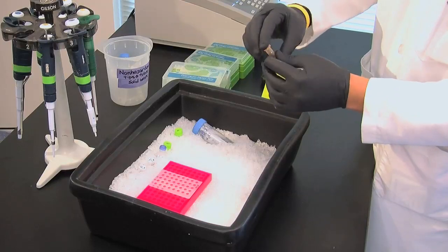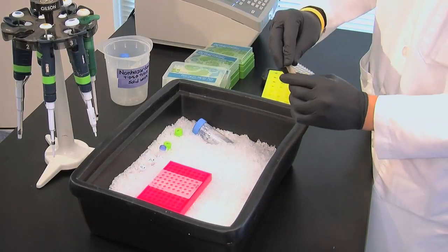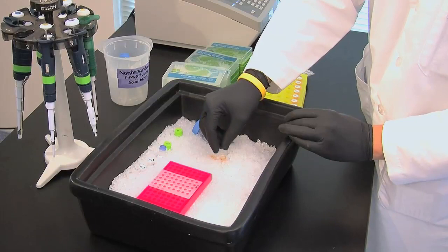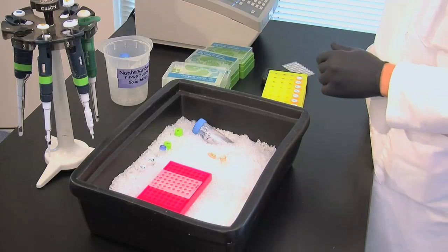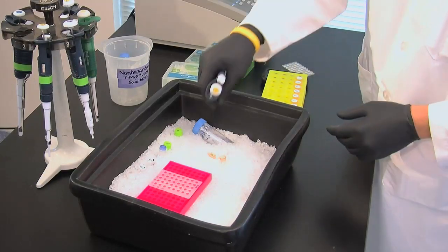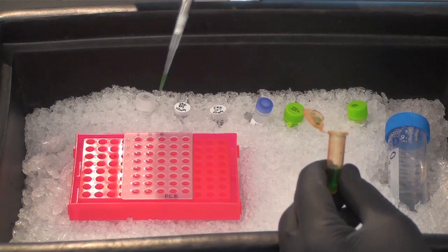The master mix is now complete. Invert it a few times to make sure everything's mixed well. Add the master mix to your PCR wells — 24 microliters to each well you're going to use. We're using seven samples, so we'll use seven wells.